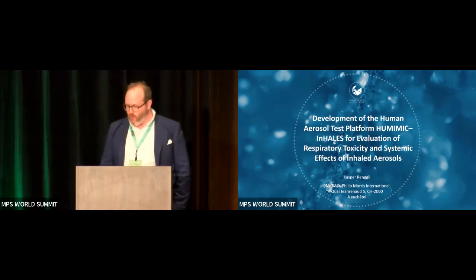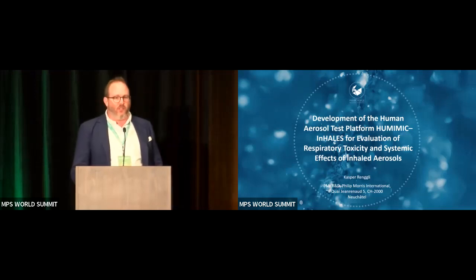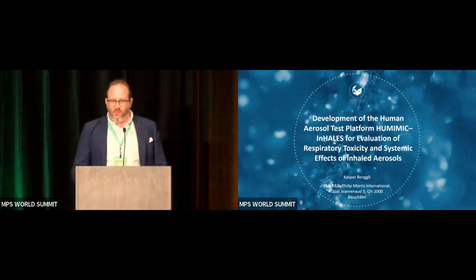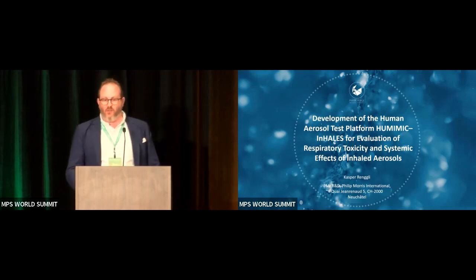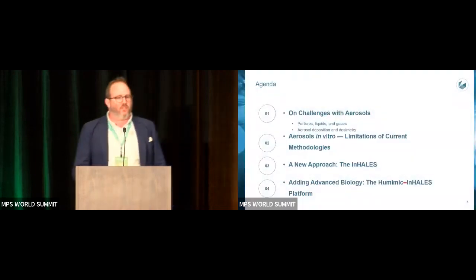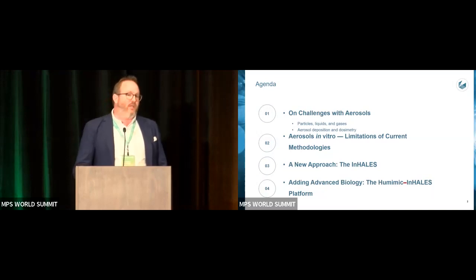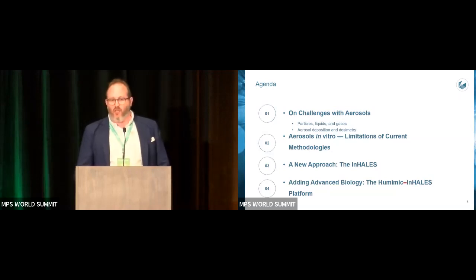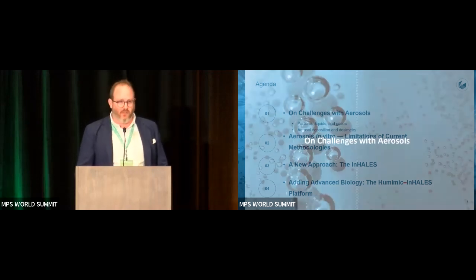I will show you our development of the human aerosol test platform, HUMIMIC-InHALES, that we do together with TissUse for the evaluation of respiratory toxicity and systemic effects of inhaled aerosols. So I will talk about the challenges that we face with aerosols, how we want to model them in vitro, and show you the approach we use for that, and then the combination with the tissue system.